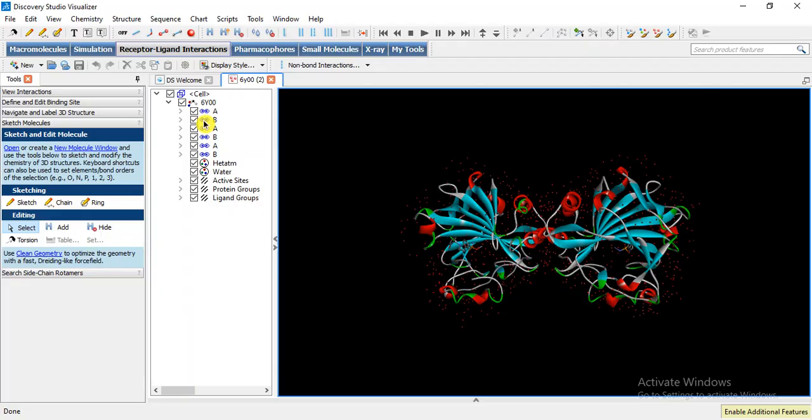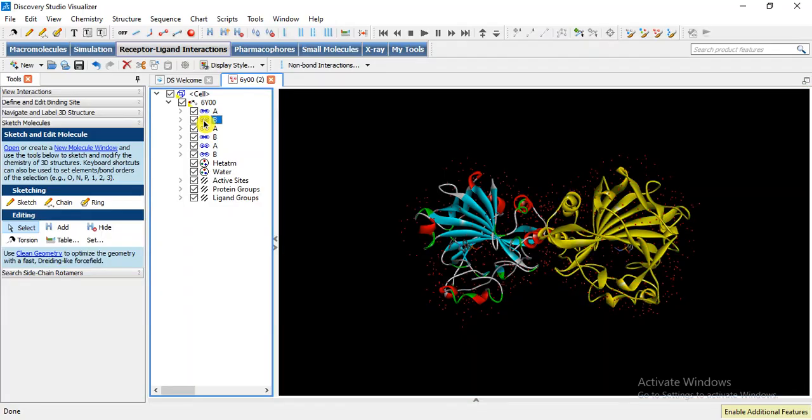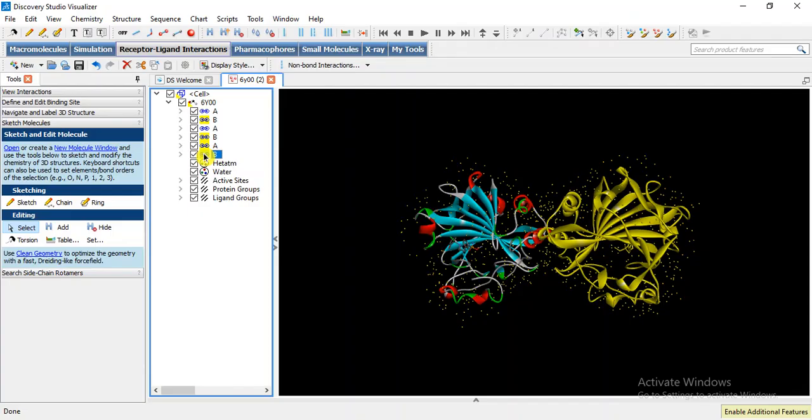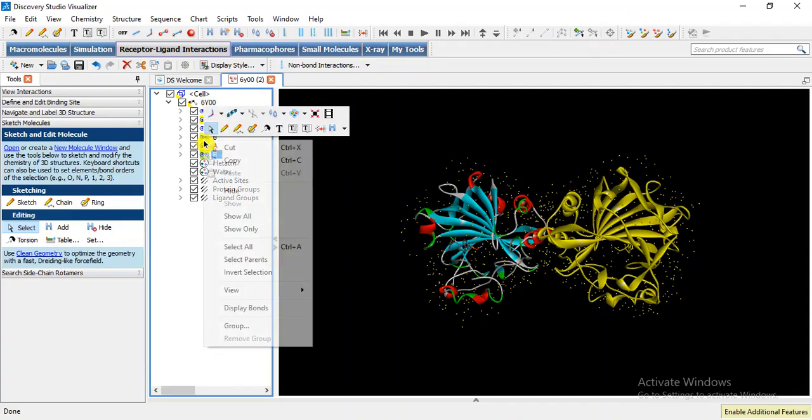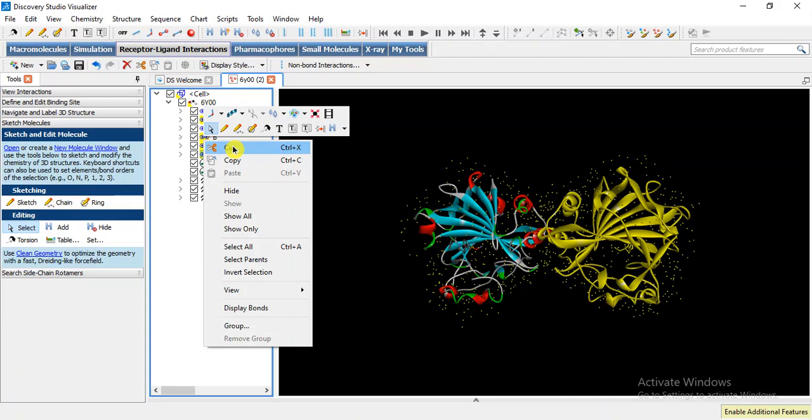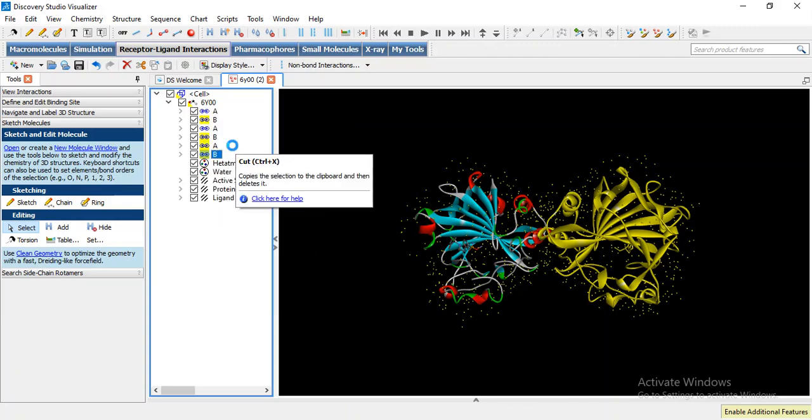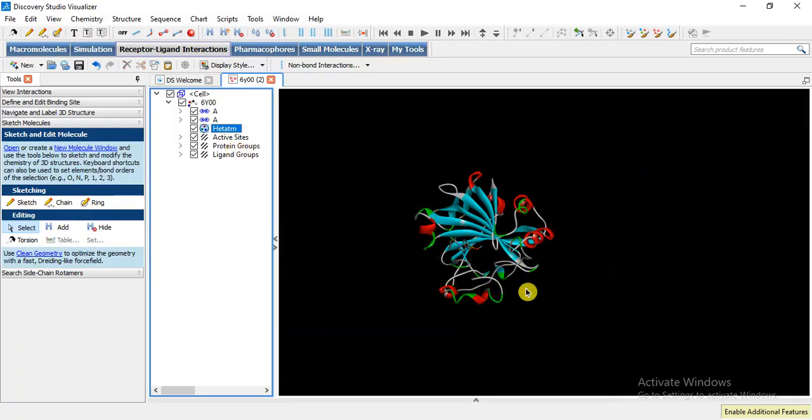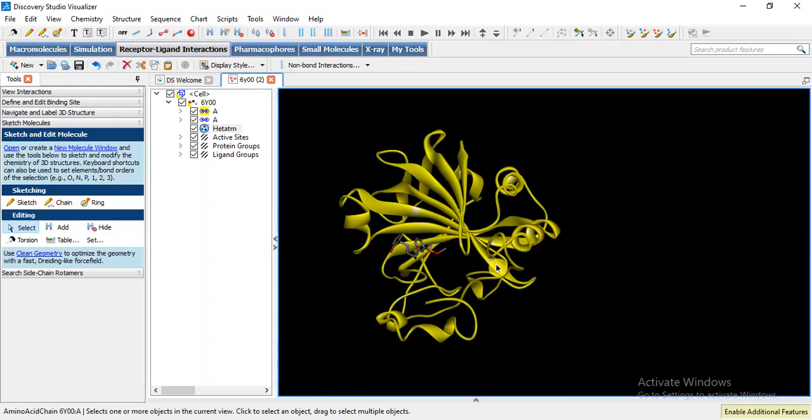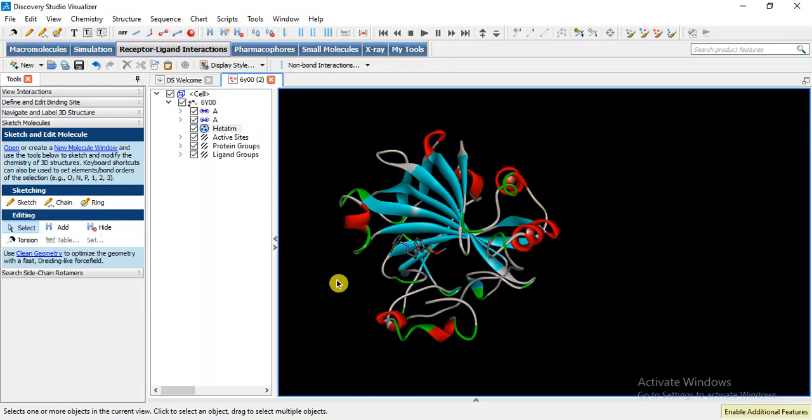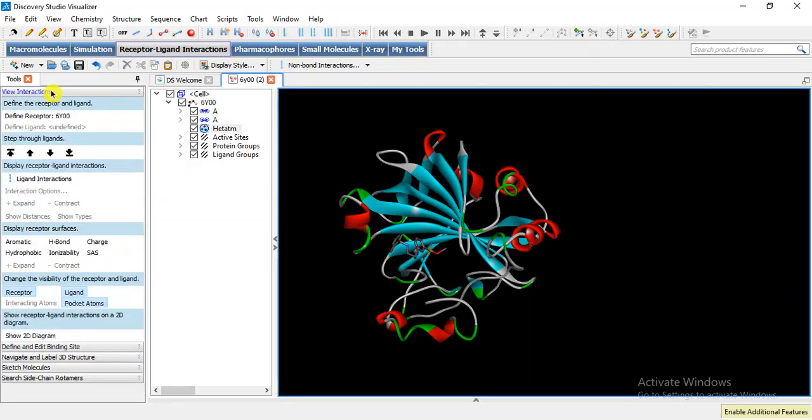So I am going to select B, its ligand and water molecules of chain A and water molecules of chain B. Now I am going to cut it. Simply by right click we can cut and here is our receptor.